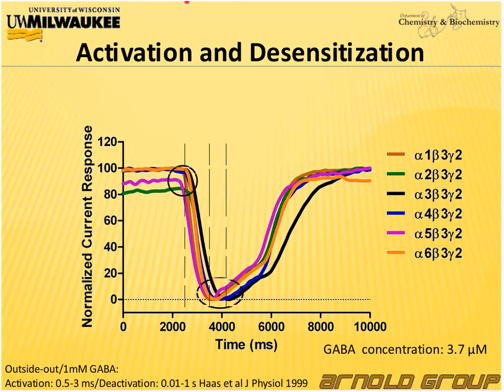In our case, with our conditions, we find that the activation takes, for all except the alpha 3 subunit containing receptor, 1.1 second, whereas for the alpha 3 it is 1.6 second.